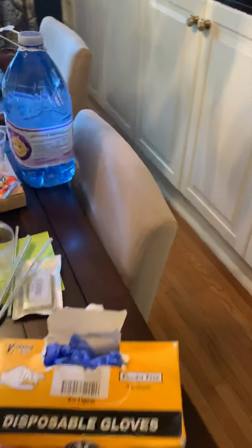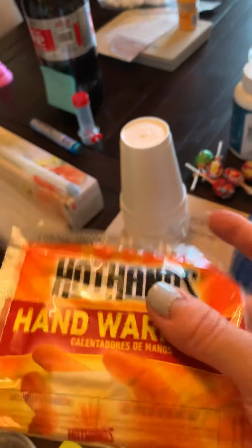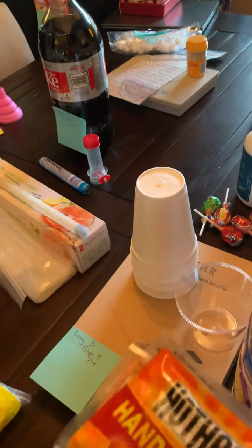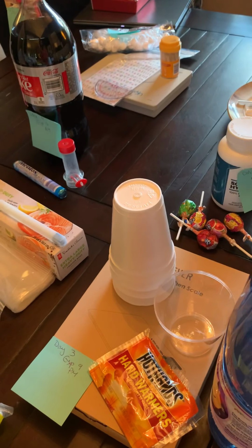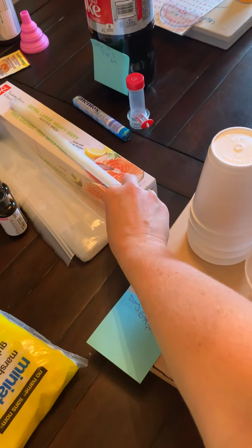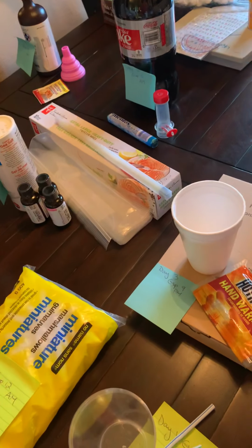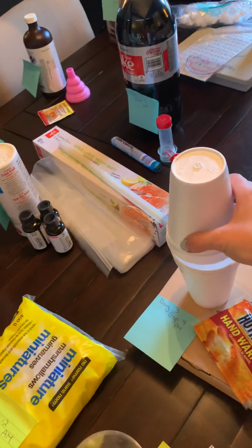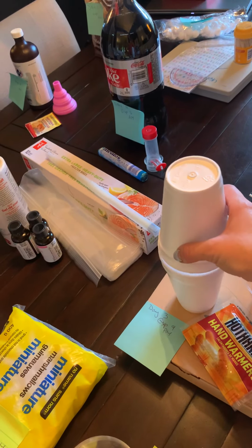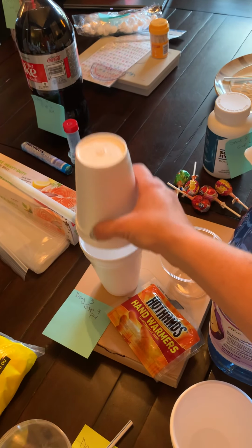Then we're gonna do a calorimetry one. This is one I'm gonna do too, because I'm gonna open up a hot pack, which you're not really supposed to do, but I've done it before, and a cold pack. And we're gonna do some calorimetry. So we're just gonna see how the temperature will change. So I have a thermometer here. This is a demo that I'm gonna do, so you don't need this material. So we have some distilled water, a scale, and we're just gonna make a little calorimeter out of these guys. I'm just gonna take them together, cover them, and make a calorimeter that's insulating. So we're trying to get an accurate temperature change and limiting the amount of heat that goes out to the surroundings.